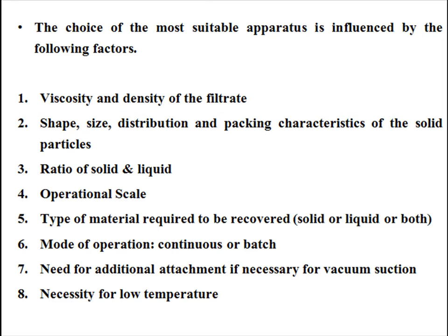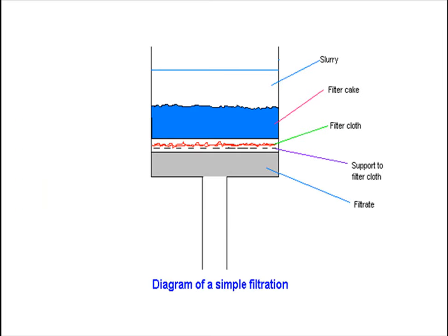The choice of the most suitable apparatus is influenced by a number of factors like viscosity and density of the filtrate, shape, size, distribution and packing characteristics of the solid particles, ratio of solid and liquid, operational scale, type of material required to be recovered, mode of operation whether continuous or batch, need for additional attachment if necessary for vacuum suction, necessity for low temperature. This is the diagram of a simple filtration unit.